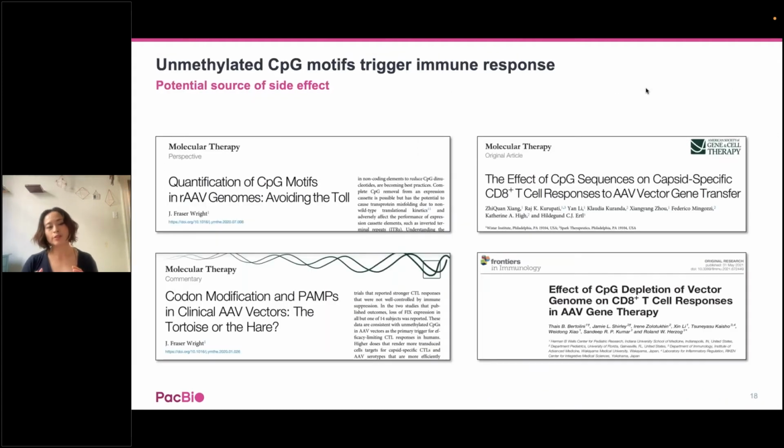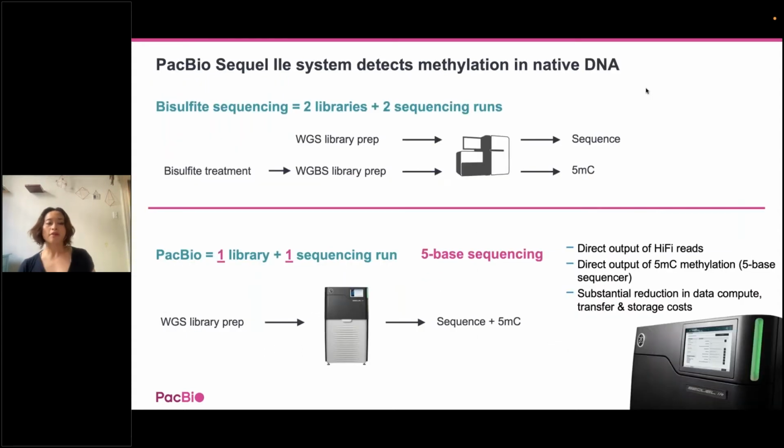And finally, I want to mention something that is, I think, on the horizon, but isn't something quite people have used PacBio for on AAV yet. We know that unmethylated CpG motifs in AAV genomes are potentially an issue to think about, as they might trigger an immune response. Now, with the latest SMRT Link release from PacBio, we can actually natively output 5mC information. And this does not require extra sample prep because there is no amplification. In essence, AAV library preparation is a little bit like a whole genome sequencing library preparation. You can actually get for free your fifth base, which is the methylation signal.